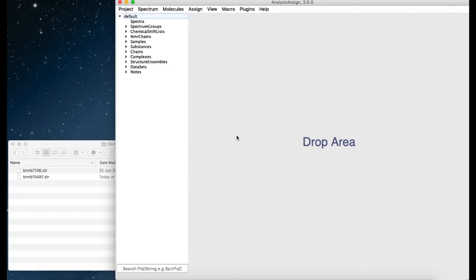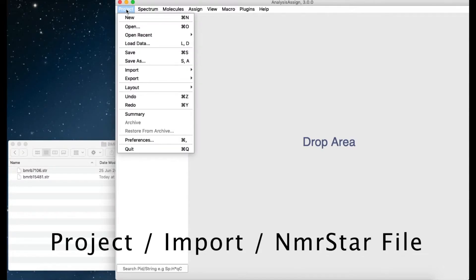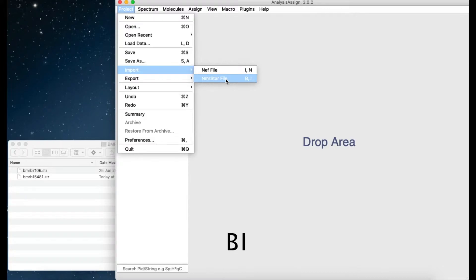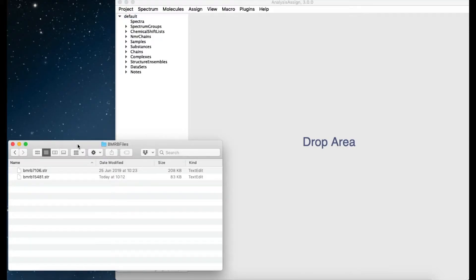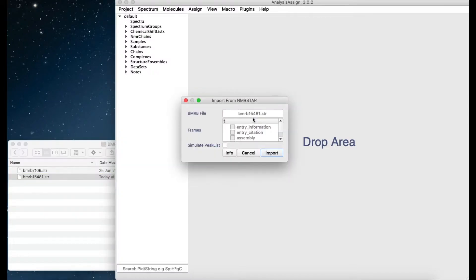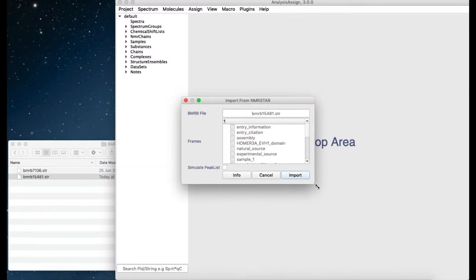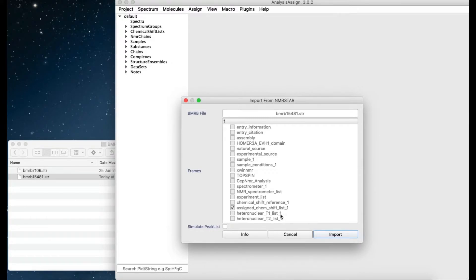To import a BMRB shift list, simply go to Project, Import and then NMR Star File, or you can type the keyboard shortcut BI for BMRB import. Alternatively, you can go to your file browser, choose your NMR star file and drag it into your project. You should then get a pop-up which will show you, amongst other things, one line called Assigned Chemical Shift List which has a little tick. This means we are able to import an Assigned Chemical Shift List. Click Import and the import will go ahead.